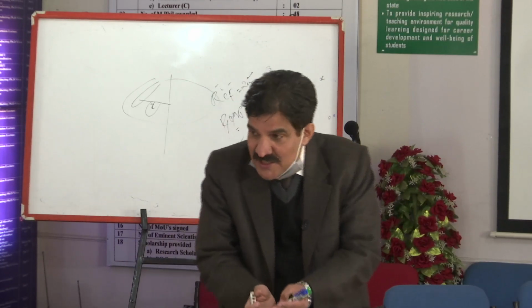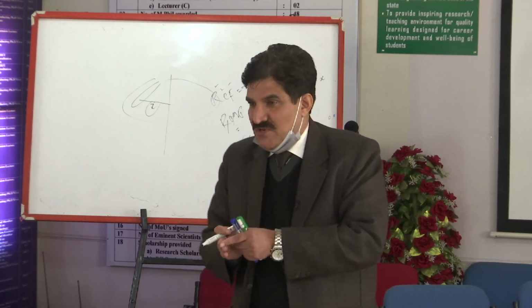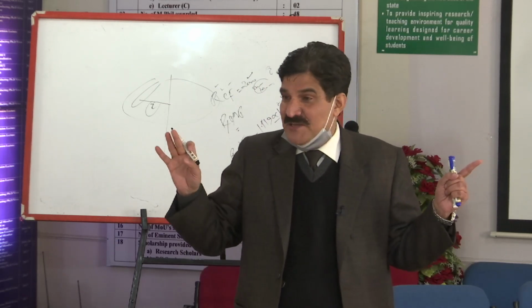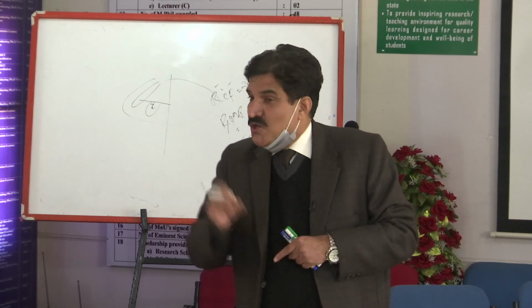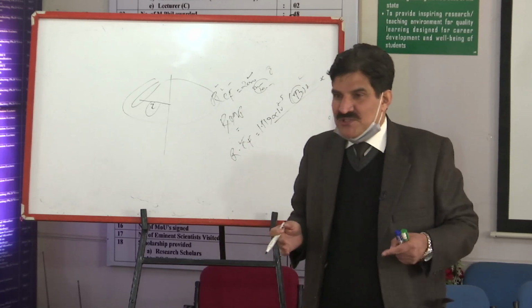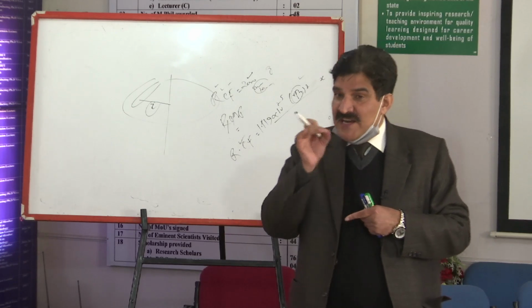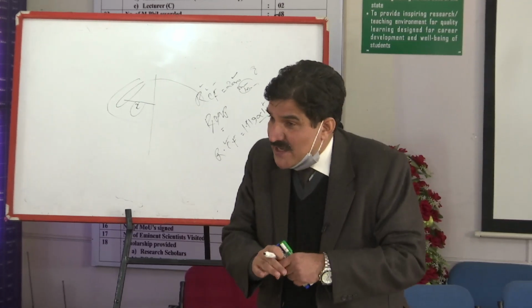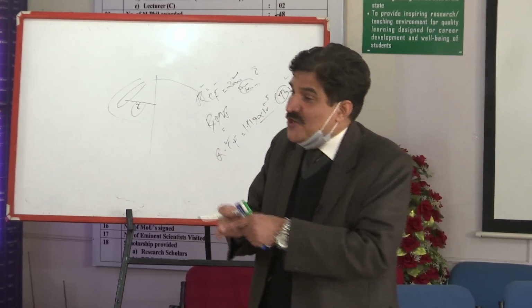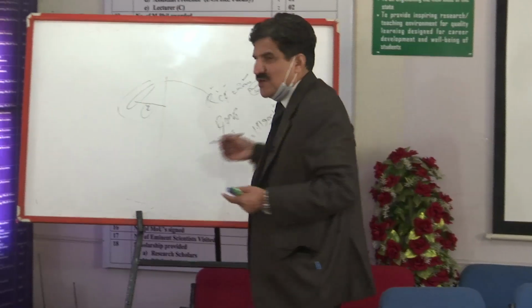You get the precipitate containing a lot of other things, and your DNA will be in solution form. Now what is your next step? Your next step is to get DNA only, that is purification from other components. The whole process is isolation. The second step is that you have released DNA, it is in solution, and from the solution you have to get DNA out. So there are some other processes which you take into consideration.